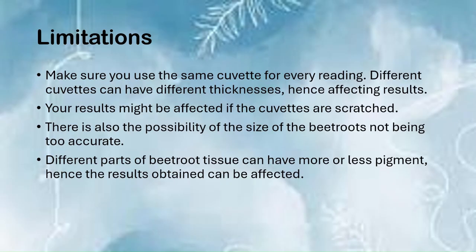There is also the possibility of the size of the beetroot pieces not being accurate, so once again affecting the permeability, and different parts of beetroot tissue can have more or less pigment, hence the results obtained can be affected.